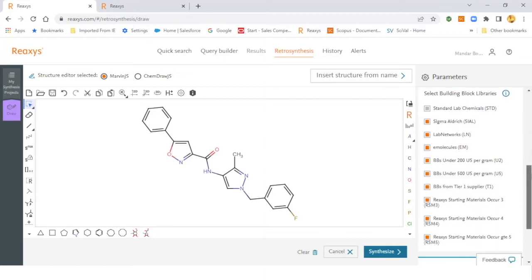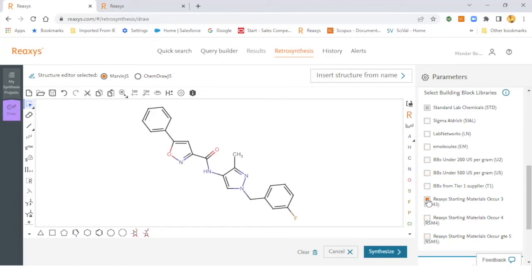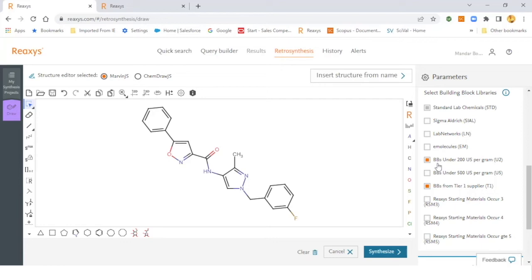Then one can play around with the building block libraries. One can select or deselect the building block libraries of their own choice. And one can also play around with the cheaper starting materials and the tier one suppliers in combination with that, if they want to receive those starting materials within one week of time. So if you choose building blocks from tier one suppliers and also US dollar 200 per gram, then you can get the synthesis route with cheaper starting material that will be supplied to you faster. You can then hit the synthesize button.